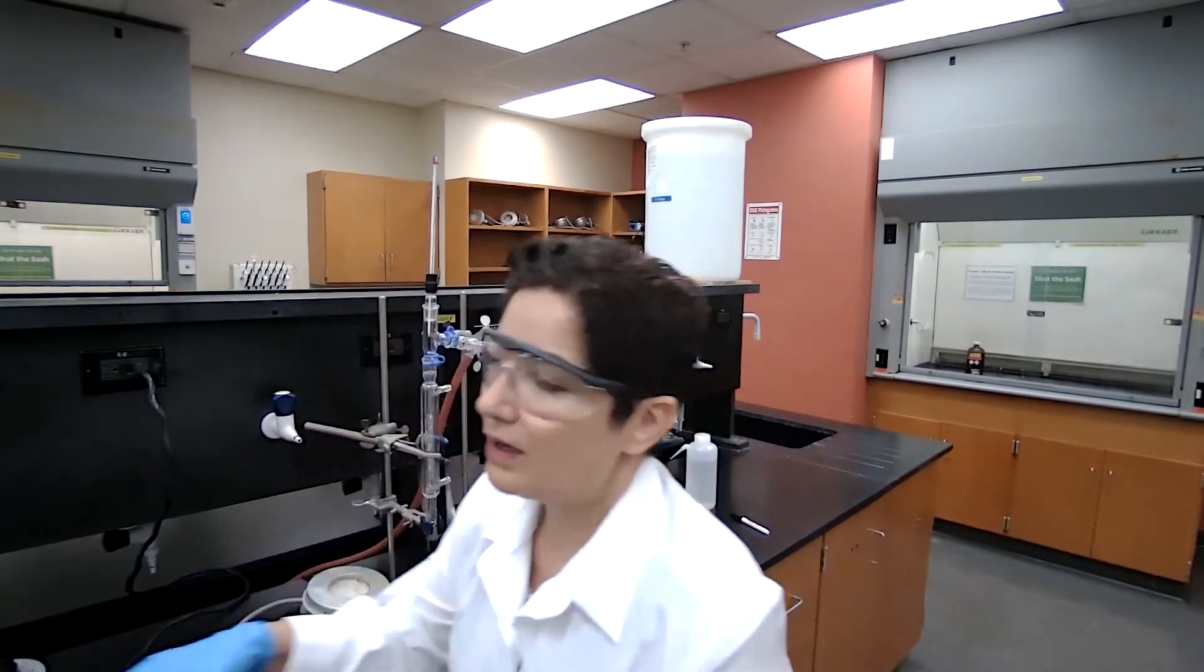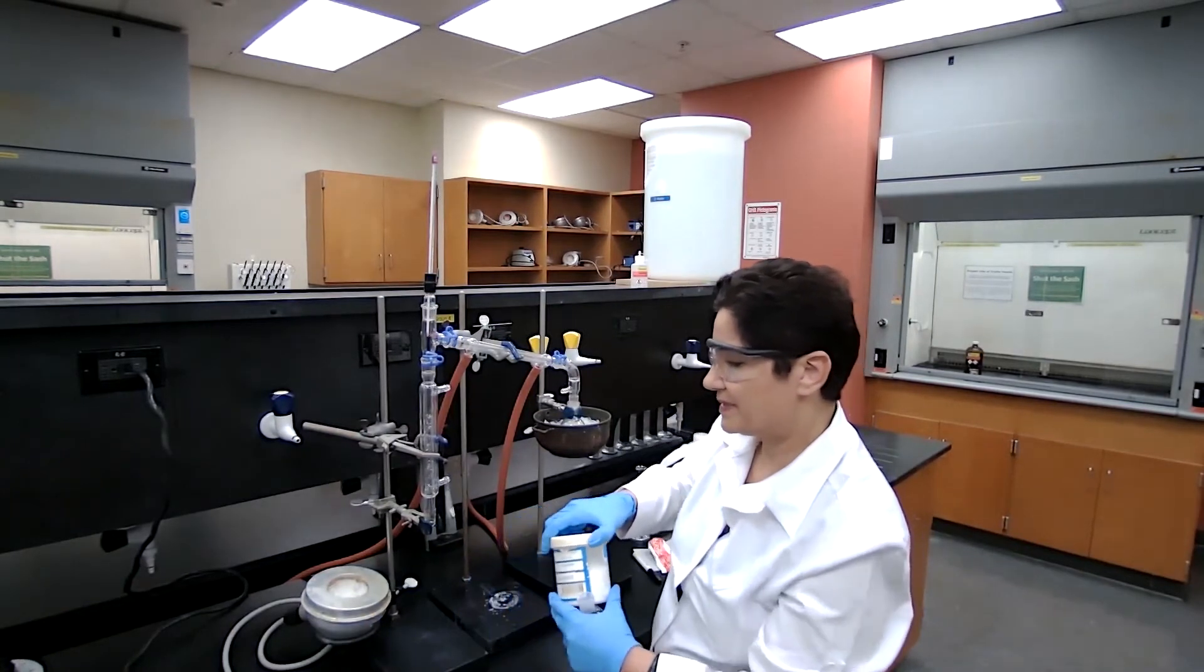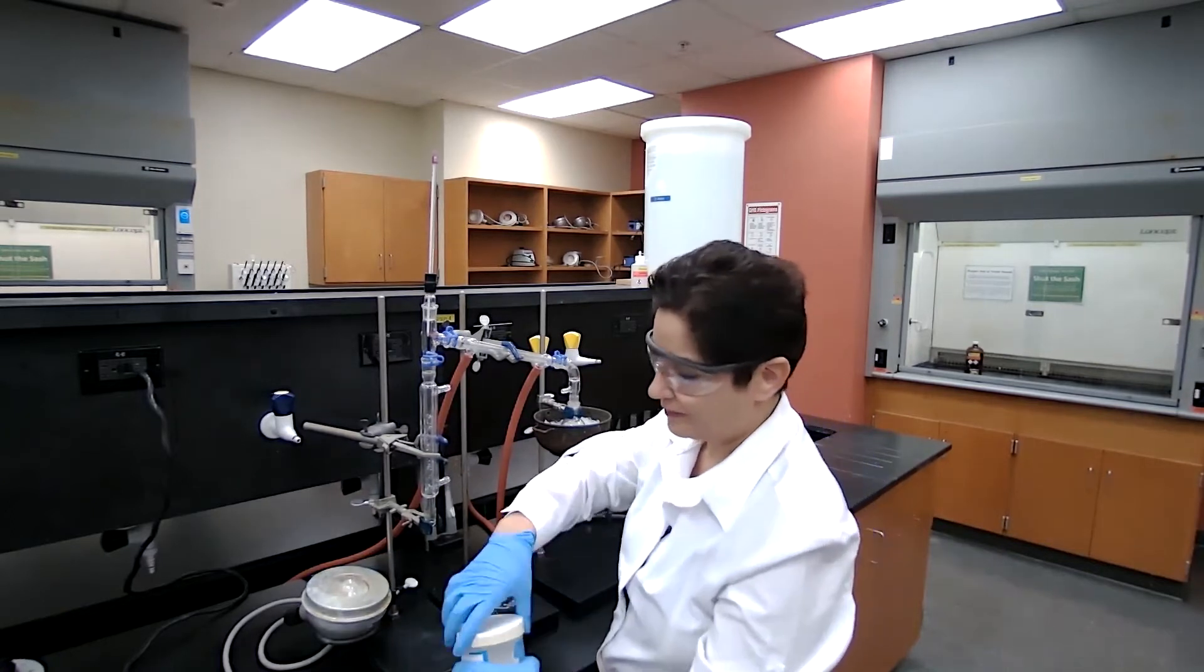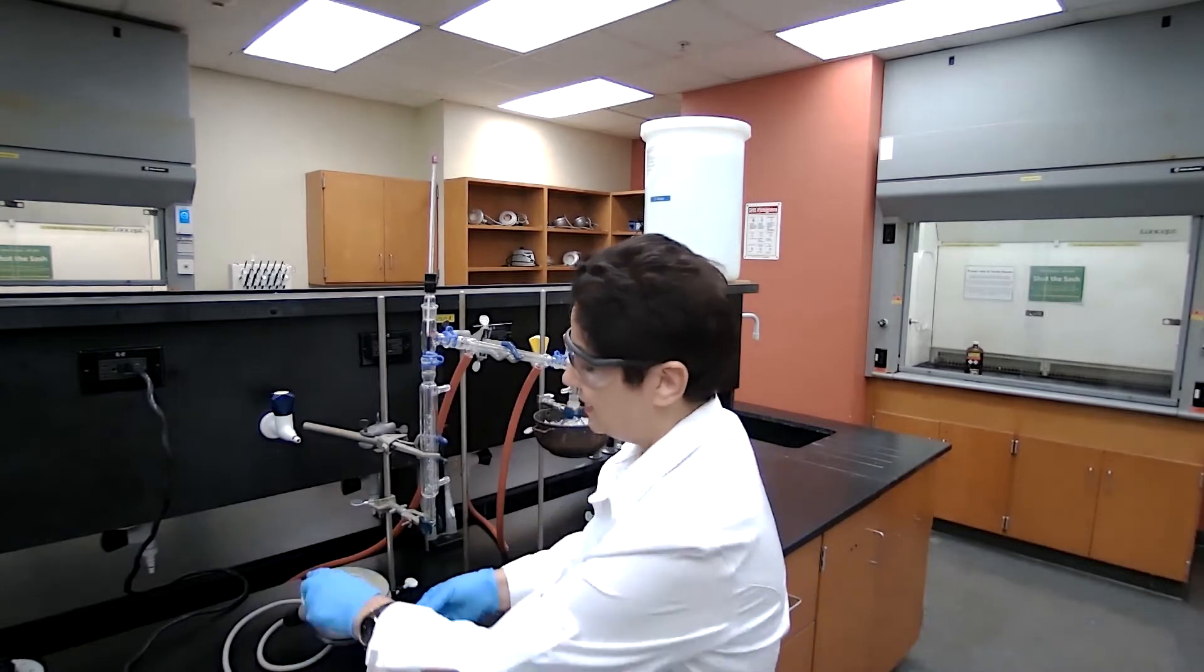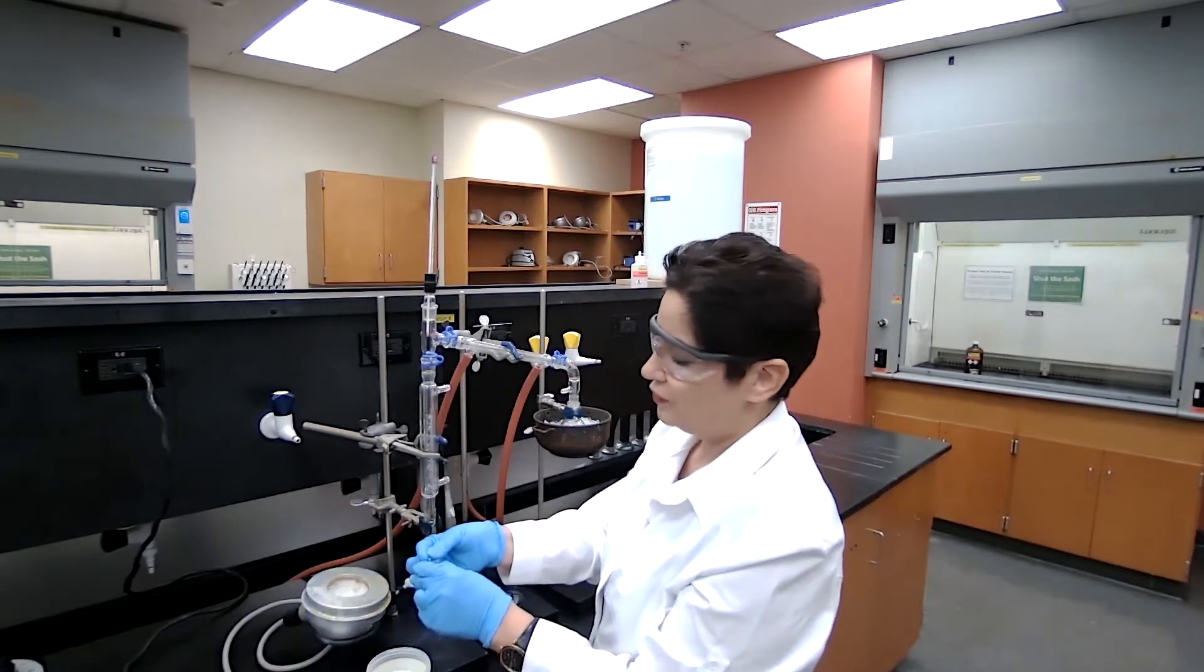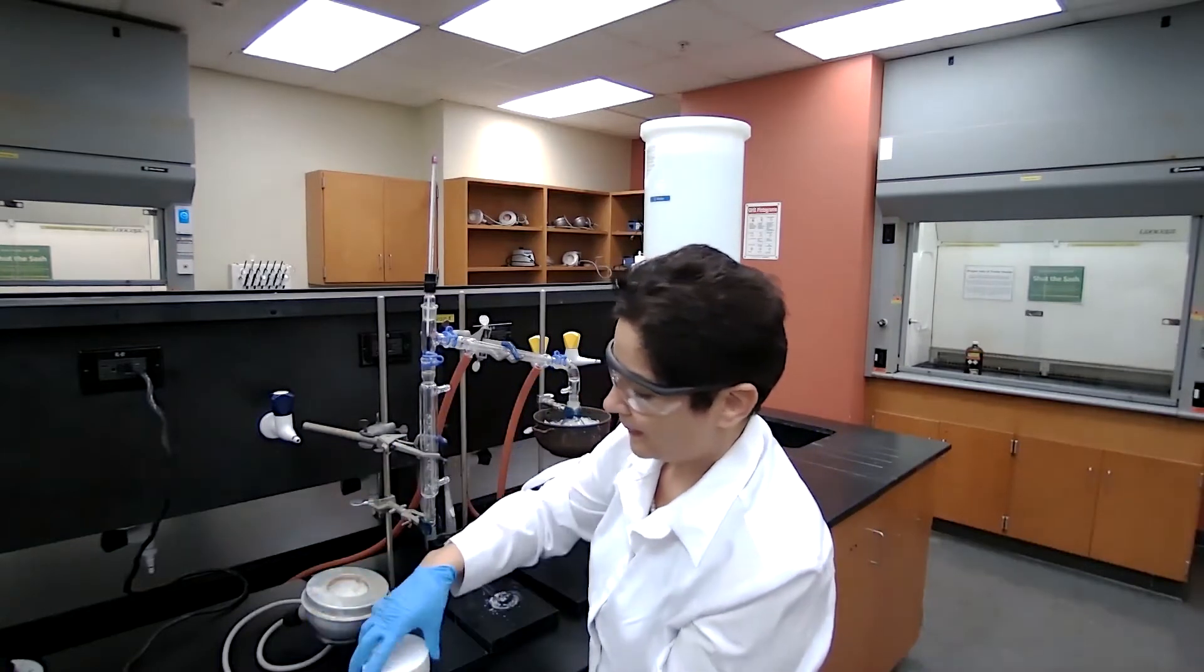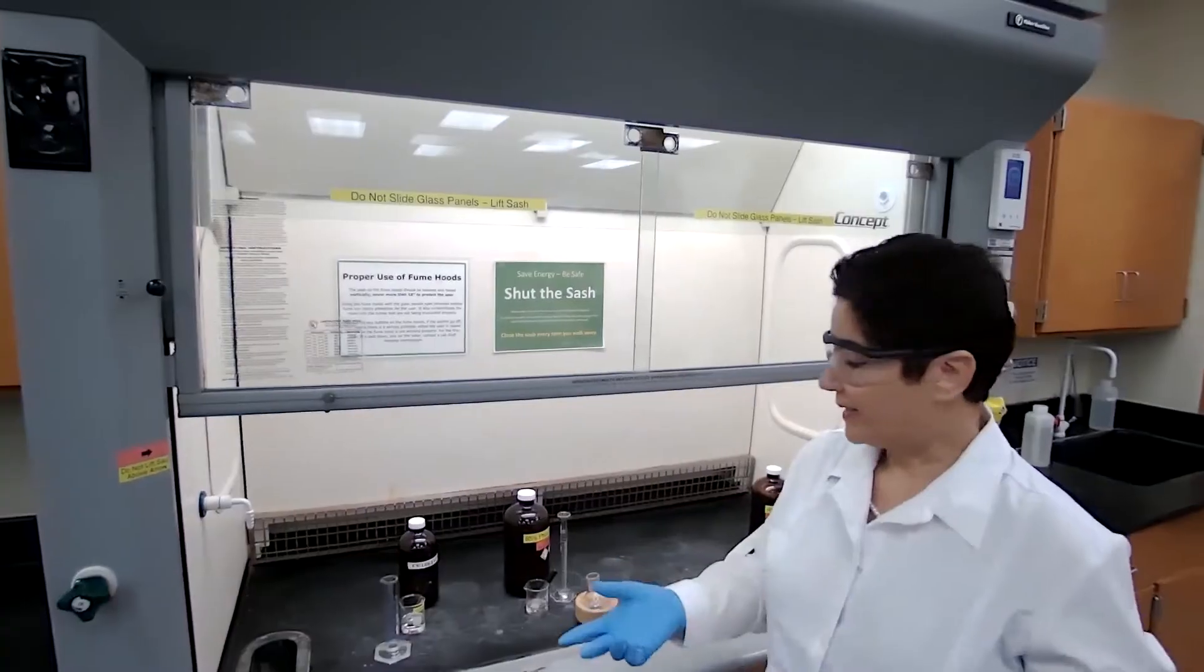I want to also add the boiling chips. The order of when to add the boiling chips doesn't really matter, but you want to make sure before we start the distillation we add the boiling chips. So I'm adding three to four pieces of boiling chips. And we add the acid. For the acid, we are going to the fume hood.